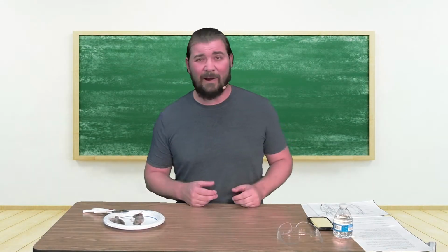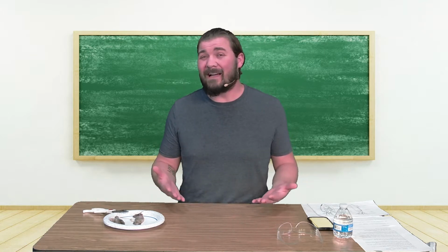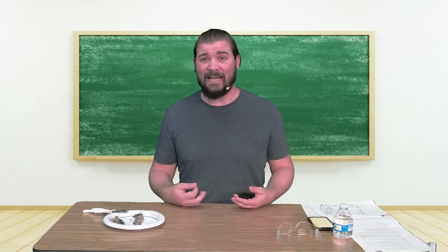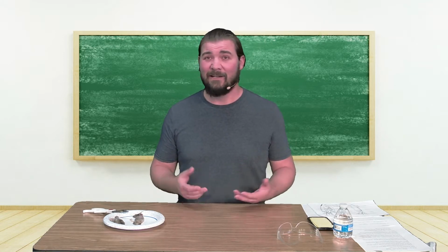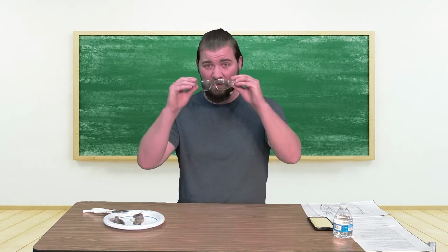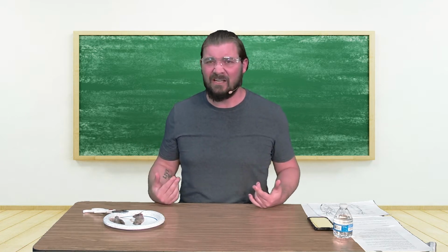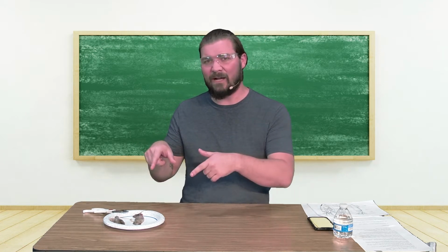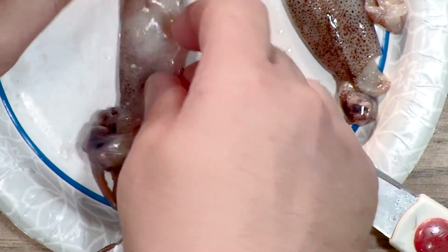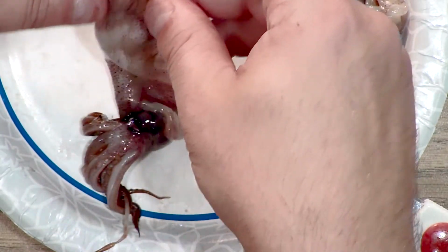All right, so now it's time to look inside the squid. And probably is not going to happen, but just in case, I don't want anything to fly and hit me in the eye or something and I lose my contact. That makes a whole different video, although it does sound pretty funny. I don't wish that on anyone. So I got my science specs here. I'm going to put those on just for some protection. It's a great idea. And let's dive right into this guy. Sorry for the ocean pun there with diving in, but you know, that's what you got to do sometimes.